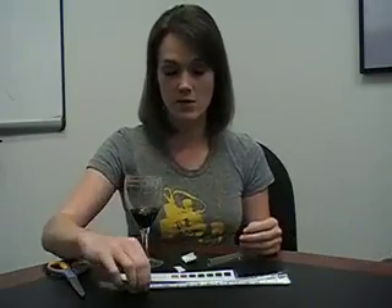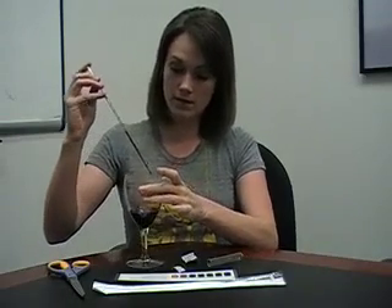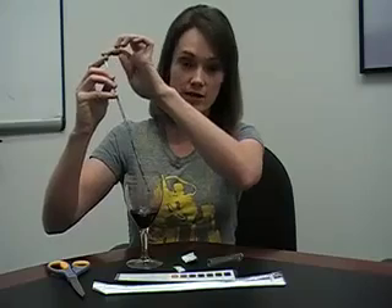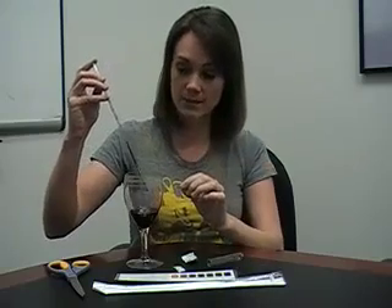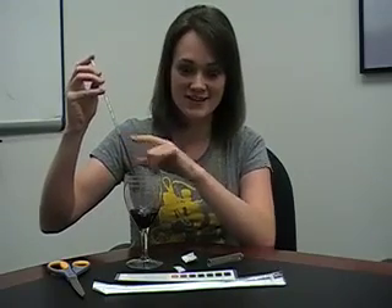Next, we're going to take a 1 milliliter pipette and we're going to drop a 0.5 milliliter sample of the wine. Don't forget to put your finger at the top of the pipette in order to keep the wine where you want it to be. Right now it's at exactly 0.5, so that's great.